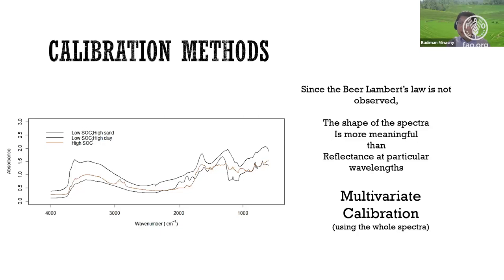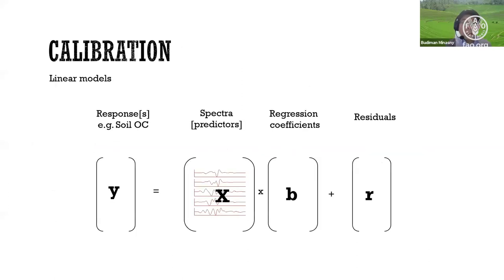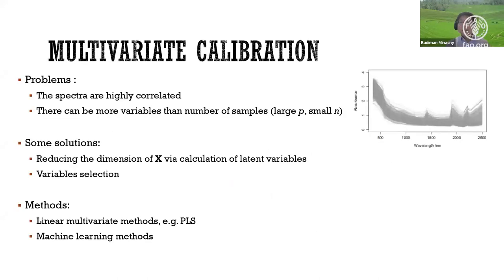But in the lab analysis, lab NIR, we got ultraspectral, we got thousands of wavelengths, right? Which are difficult to handle if you're using a standard linear regression model. Because with a linear regression model, it's just a matter of what's your soil variable you're interested in, and this spectra you multiply by regression coefficients, then you get some kind of calibration function.